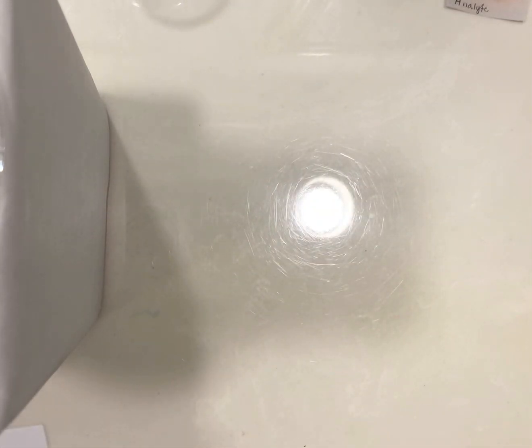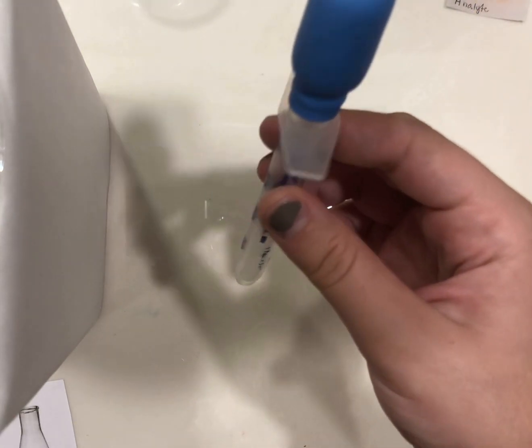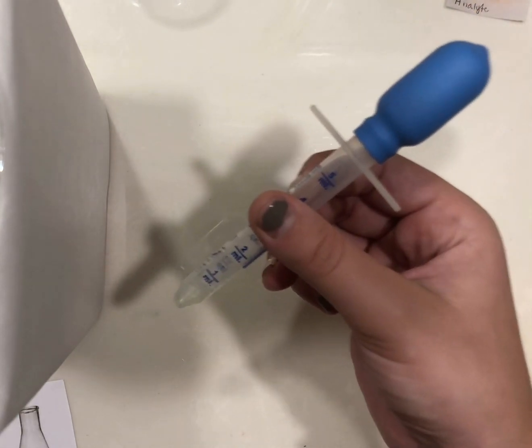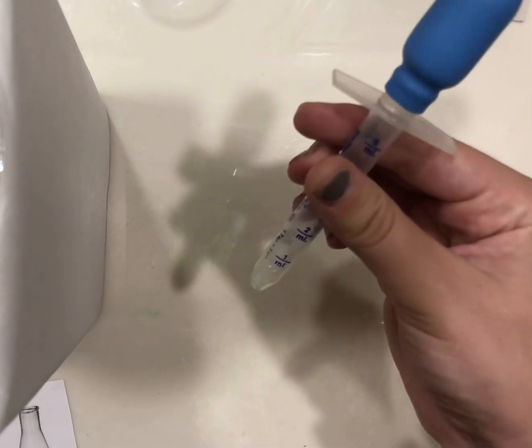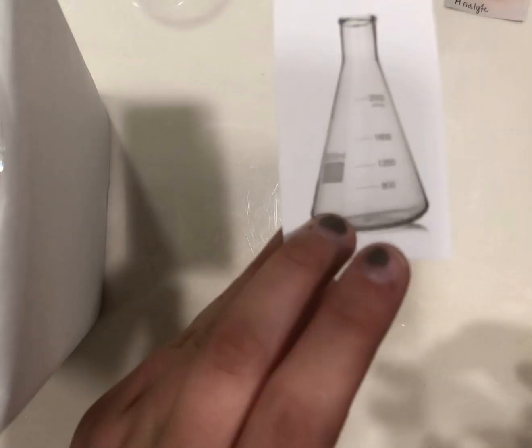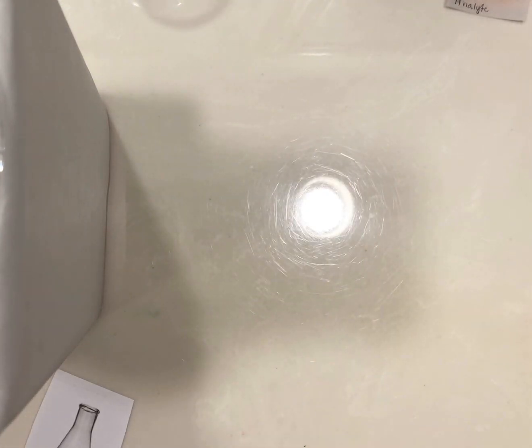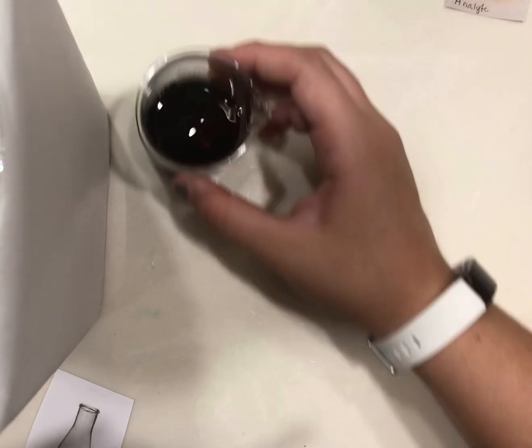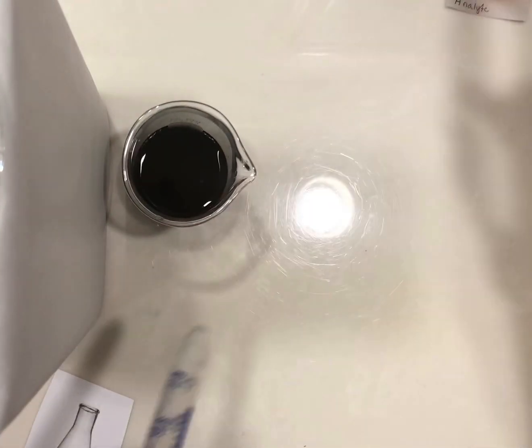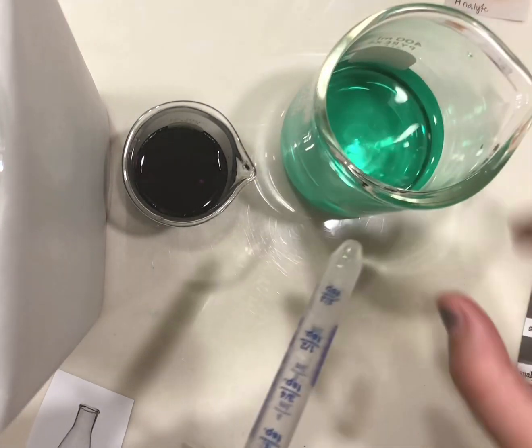So the first thing we're going to do is, this is already clean, so we're going to go right into the redox titration. Using a pipette bulb and a volumetric pipette, which I do not have, I'm just going to use a standard dropper. We're going to transfer about 25 milliliters of the unknown into an Erlenmeyer flask, and then from the flask, we're going to transfer that into the burette. So this is our titrant, which would have been in the burette, and then we have our analyte.